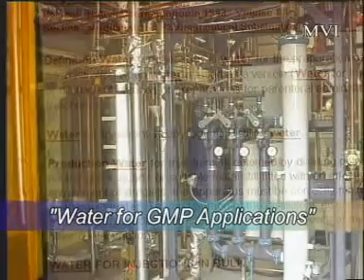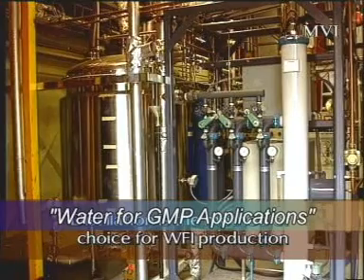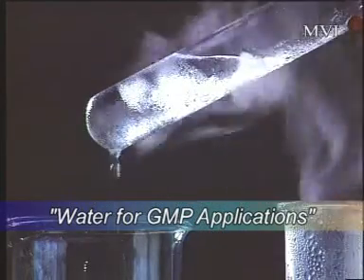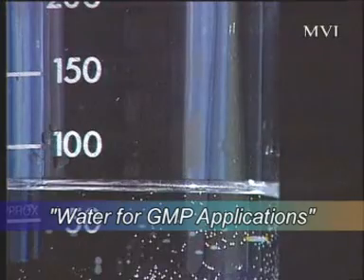In practice, distillation is the method of choice as the most secure method of WFI production. Distillation is the process of boiling a liquid, in this case water, and condensing the vapor. The liquid collected is called the distillate.